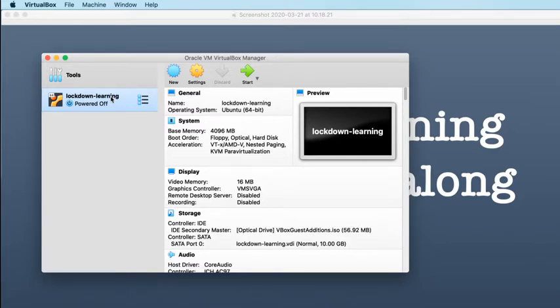So there's been quite a few emails and comments on the YouTube video that I've tried my best to address and get people up and running to this point. So if you are still at a point where you haven't quite got a working setup that I had at the end of yesterday's lesson, then do get in touch.